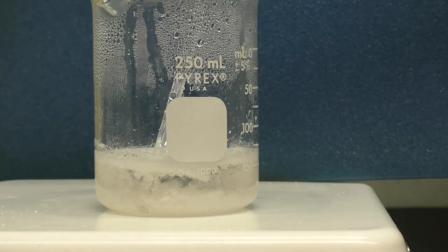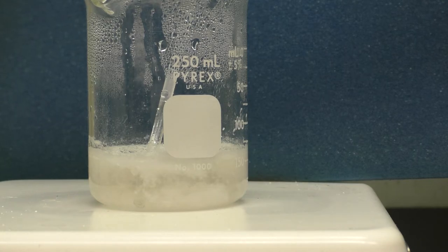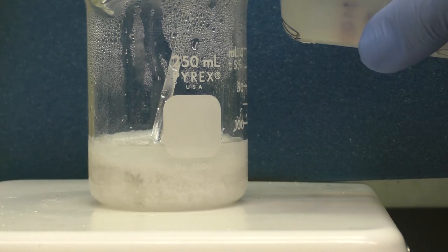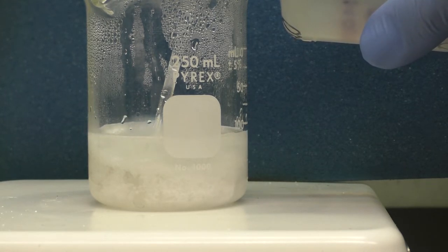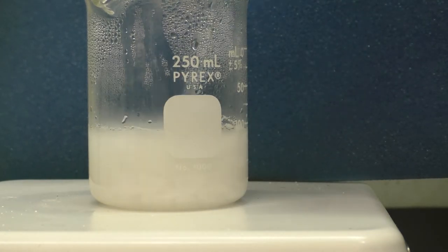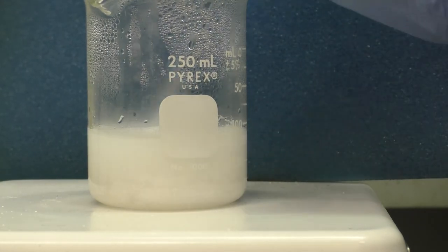Now initially as that cools, you'll see the formation of solid as a lot of material comes back out of solution due to the temperature change. This really tells me that we're very close to a completely saturated solution here. We need to increase the volume and let this boil again to get everything fully dissolved. So upon adding, certainly a lot of material crashed out of solution, became insoluble because of that temperature change. We'll let this get back up to a boil and see if we can get everything fully dissolved.